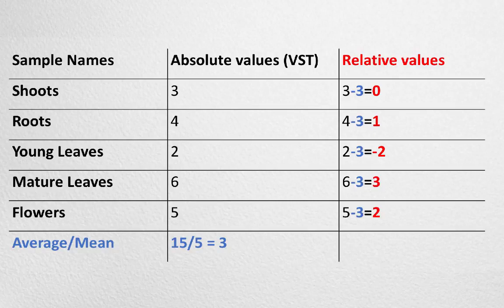We use relative values to amplify the expression differences and highlight significant color changes between samples. Unlike the absolute expression values, relative values cannot be compared with the expression values in another gene. Relative values is a ratio. There is no unit associated with the relative values.